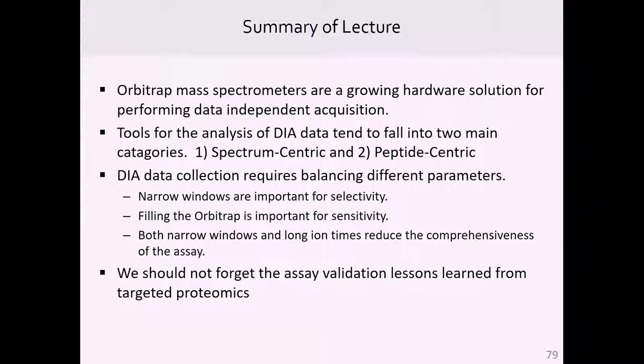Something very specific for a project, if you have several stimulatory conditions of your cell line of interest, or different cell lines that you would like to compare. So a smaller set, but equally distributed of these cell lines or cell states that you're interested in, in order to make a library, or what is a recommended setting?